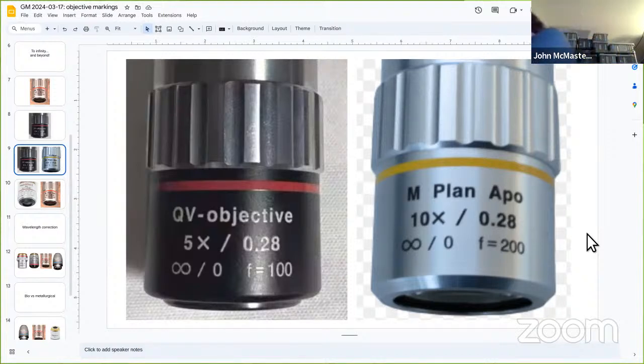In fact, I have one here if you want to see that. See if I can get this on the camera. Maybe you can see that. No, but maybe it's a tiny little hard to read.